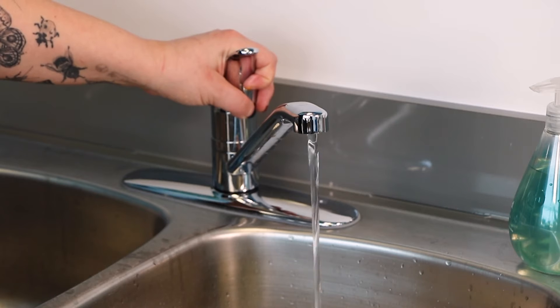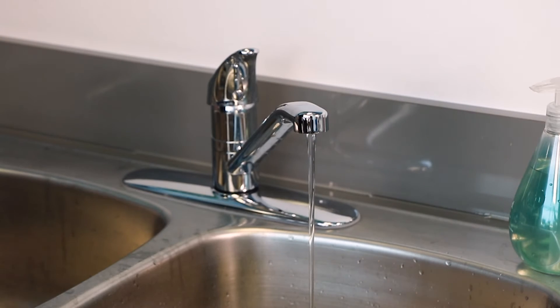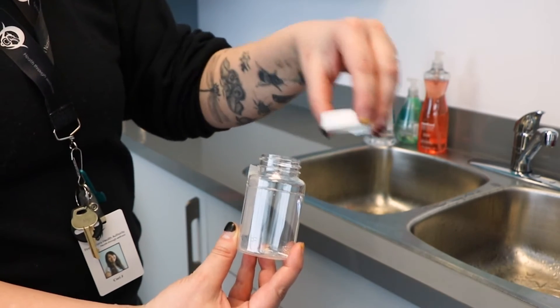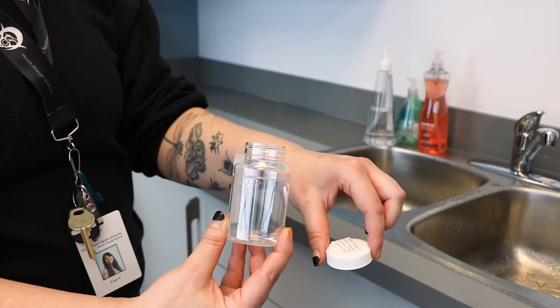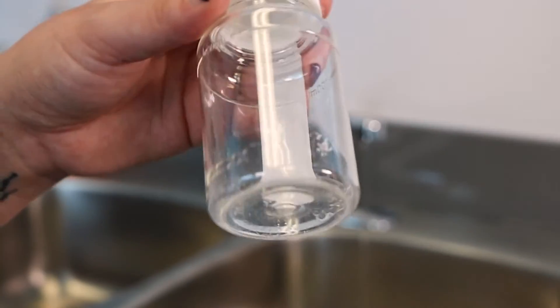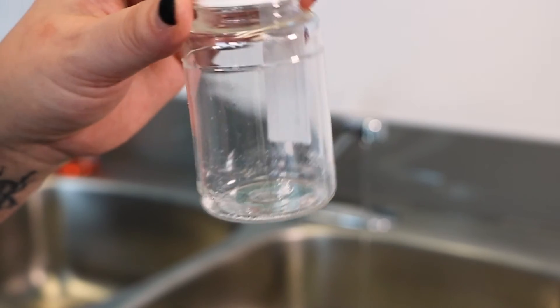Reduce the water flow before you take your sample. The flow should be slow enough to ensure that none splashes while you are filling the sample bottle — the water flow should be the width of a pencil. Hold the base of the sample bottle and remove the cap with your free hand. Hold the cap between your fingers, pointed down to avoid contamination. Make sure you do not touch the inside of the cap or the bottle with your fingers. Do not use the sample bottle if the cap is loose or cracked, the seal has been broken, the bottle appears dirty, or there are any other conditions that make you doubt the quality or cleanliness of the bottle. Do not dump or rinse the bottle before filling it. The white powder is sodium thiosulfate, which neutralizes the chlorine in the sample.